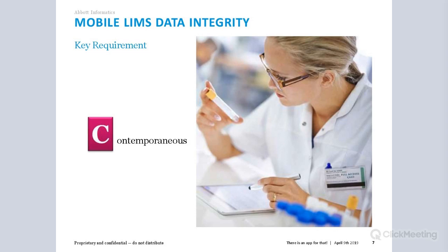Good story. In my previous life as a LIMS administrator for a laboratory, there were some questions about the quality of work being produced by one of the analysts, by management and by their peers. So by delving into the audit trail for the testing the analyst performed, let's call him Bill, I was able to quickly prove things weren't adding up.